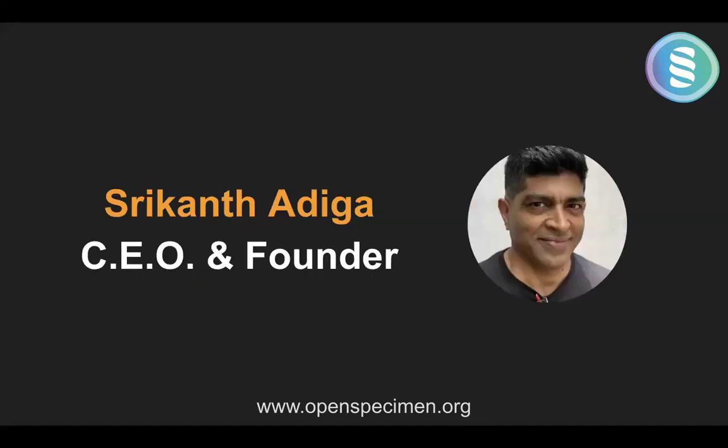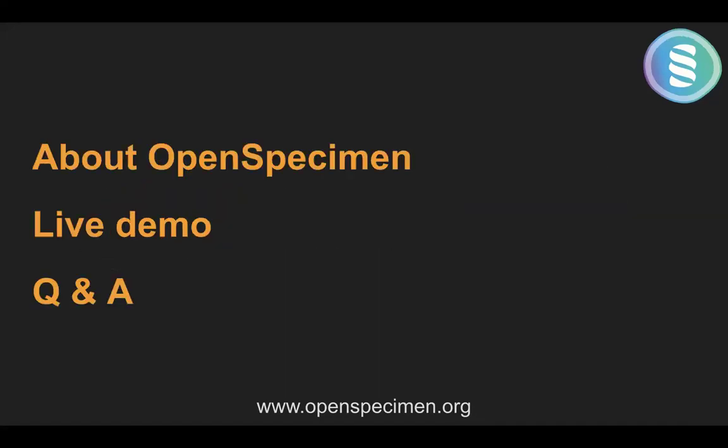So I'm Srikanth Adiga. I'm CEO and founder of OpenSpecimen. As I said, the overall agenda of the call would be a bit of background about OpenSpecimen, a live demo, and we'll keep the questions and answers to the last. But in between, you're free to post questions on the chat window, and my colleagues on the call will try to answer them. If not, we'll take all the questions at the end.